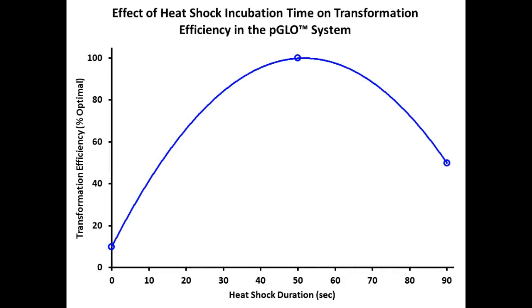So as I said, the time matters. We don't want to leave them in too long. For this particular system, it's been worked out. 50 seconds is optimal. As you leave it longer, the efficiency drops dramatically, the longer you leave it under the heat condition.